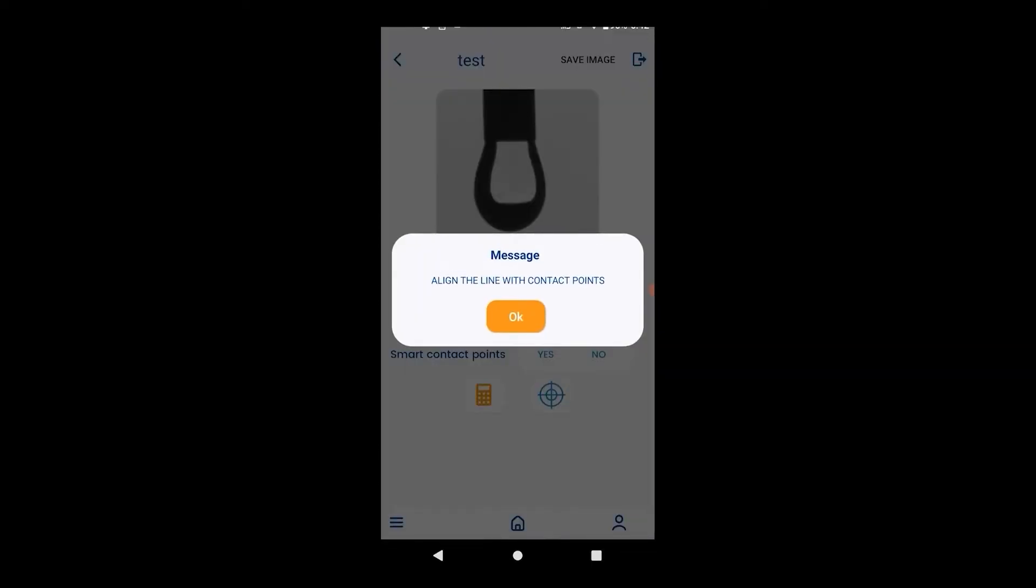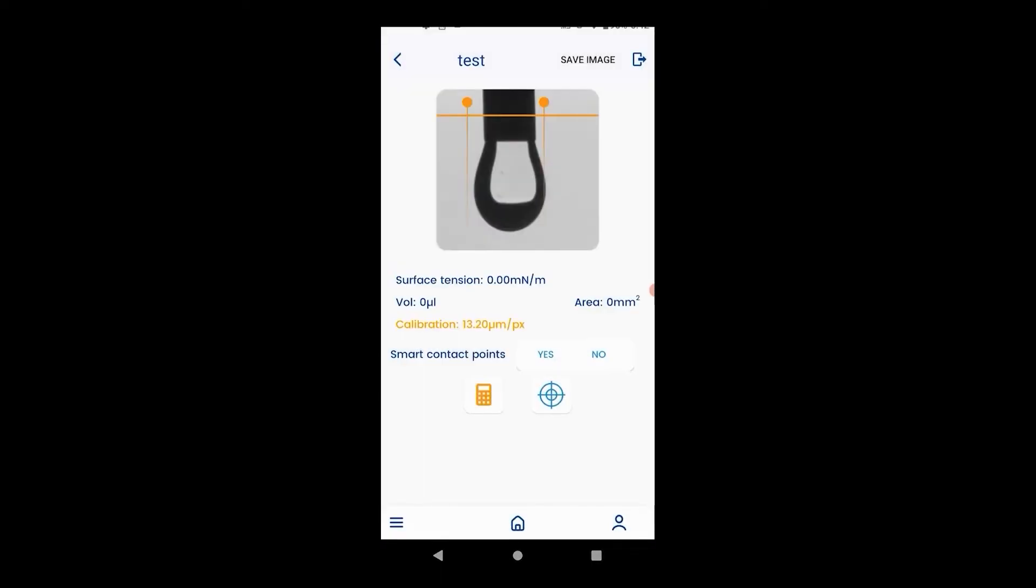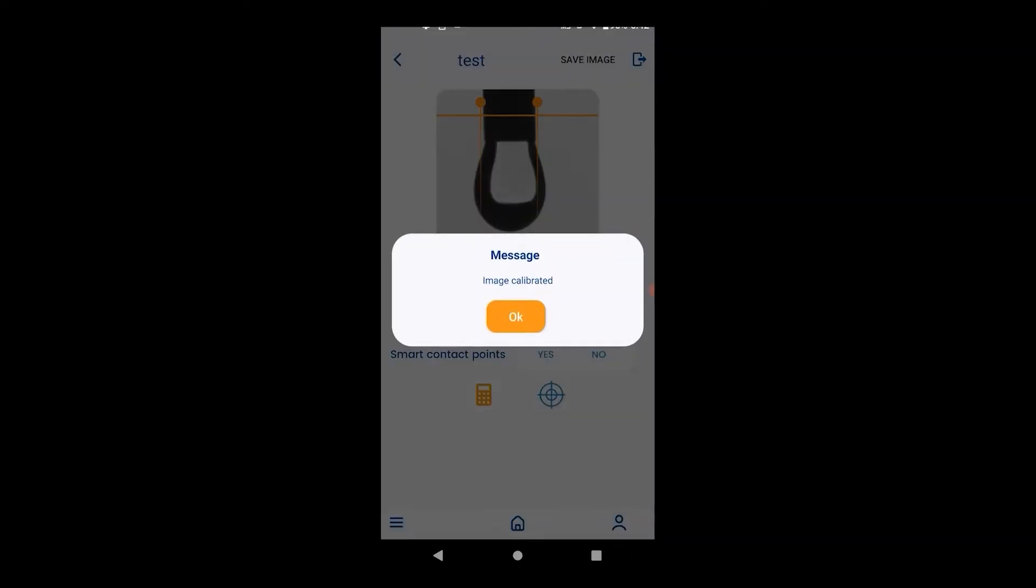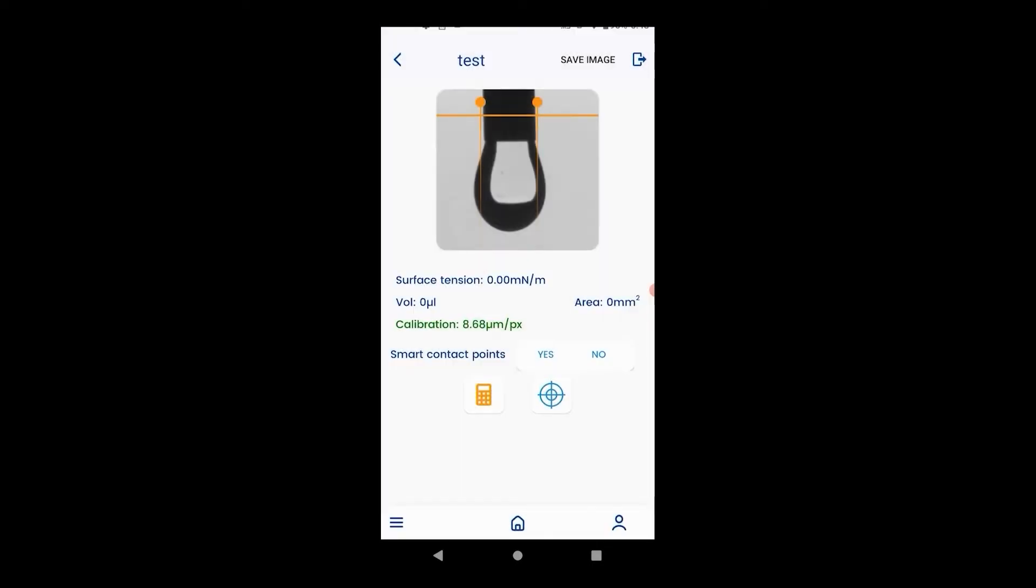Move the orange points to the left and right of the needle and hit calibrate. If the calibration number is green, then the number is correct. If it's red or yellow, then something is wrong.